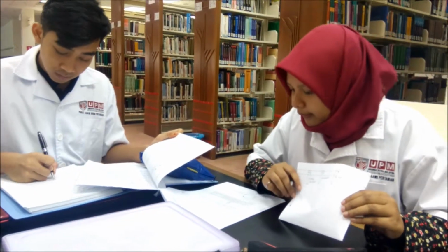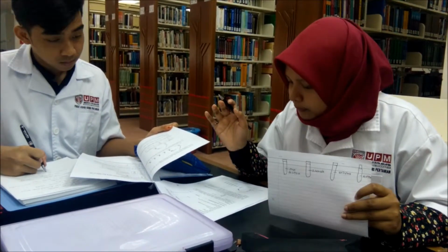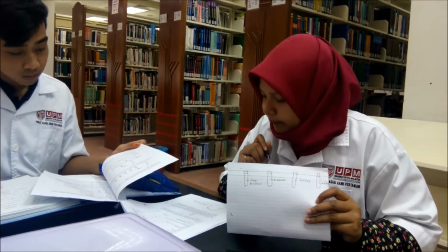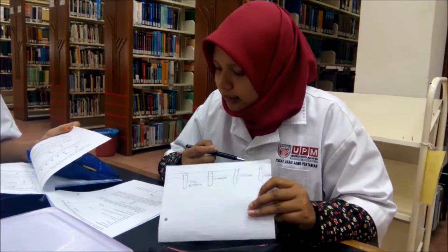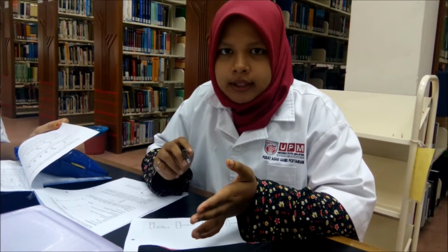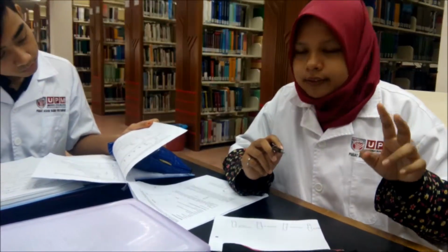Okay, so there are several steps to do the experiment. First, we label 15 ml conical tubes as stock solution, substrate, enzyme, and buffer. Each of these tubes is labeled with our group initials, and then the 5 cuvettes are labeled E1 to E5. This is according to their time points. For example, E1 is for the 1 minute time point, E2 is for the 2 minute time point, and so on.